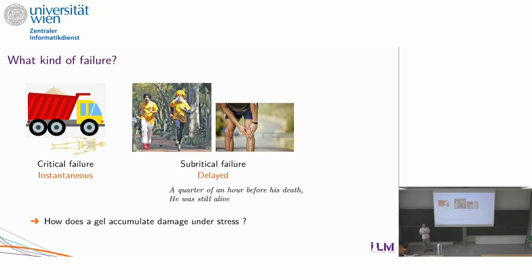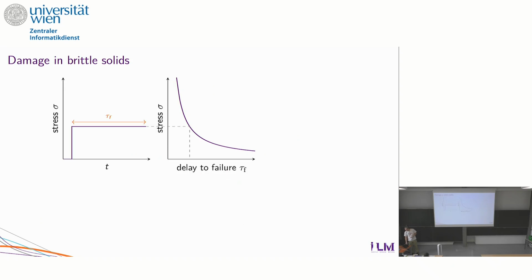that in a somehow invisible way, the material is accumulating some damage. And the question I want to ask here is, what is damage? And how can we characterize it? How can we know how a gel here accumulates damage?